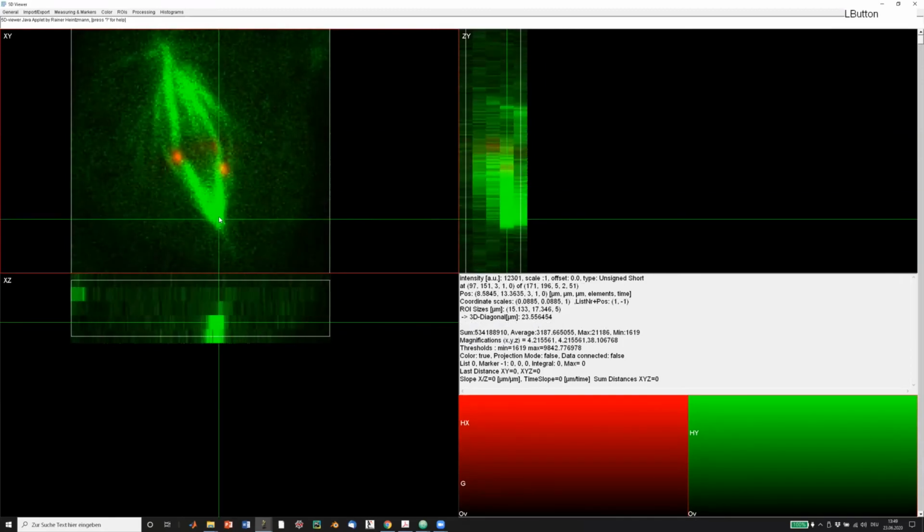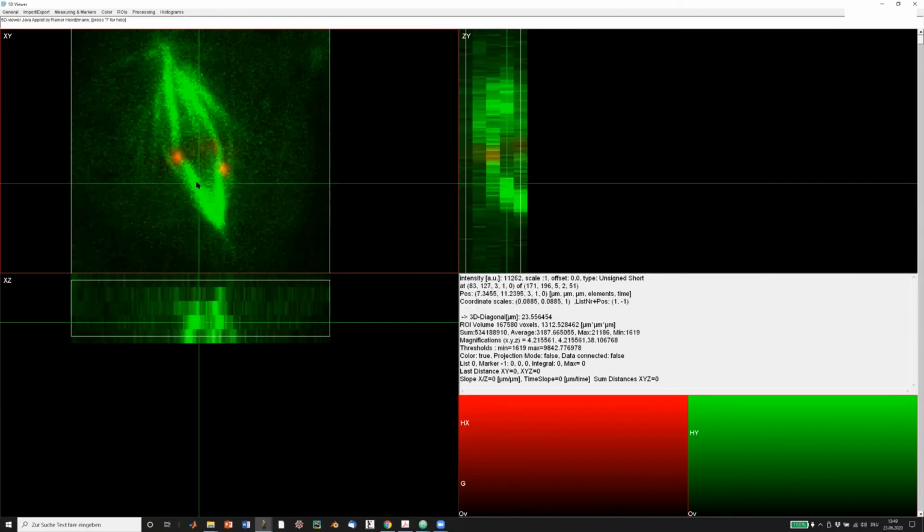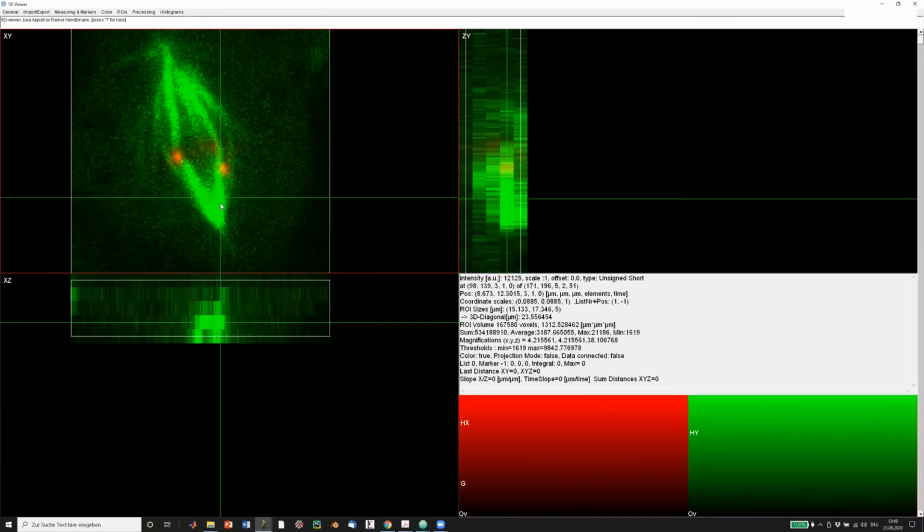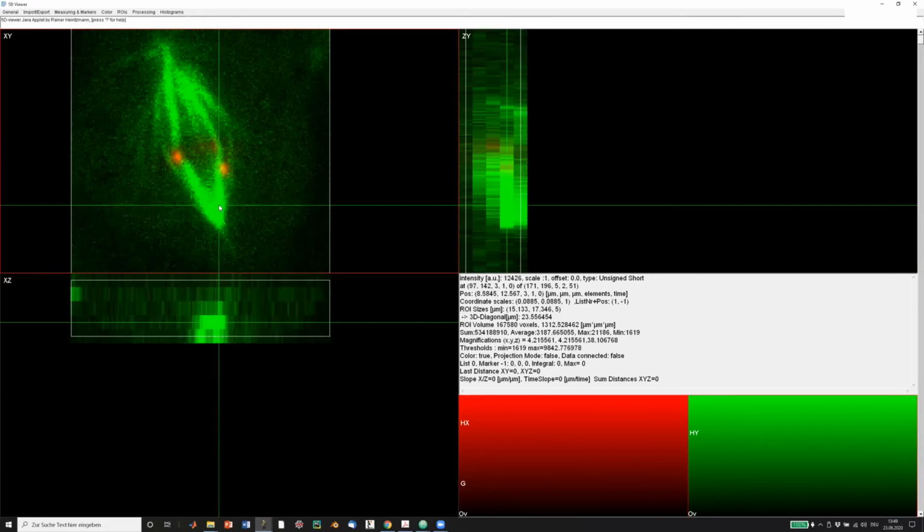And of course, we don't quite see where we are in the overflow region. Some of the pixels have different intensities, but they are displayed with the same maximum brightest green value. How can we see which pixels these are? For this, there's a key: O toggles the overflow indicator on. So if you press O once, the overflow indicator is on, and it will show blue pixels being the ones that are overflowing. And if you toggle it off again, you just see the green. So let's leave the overflow indicator on. And I was pressing 4 now.